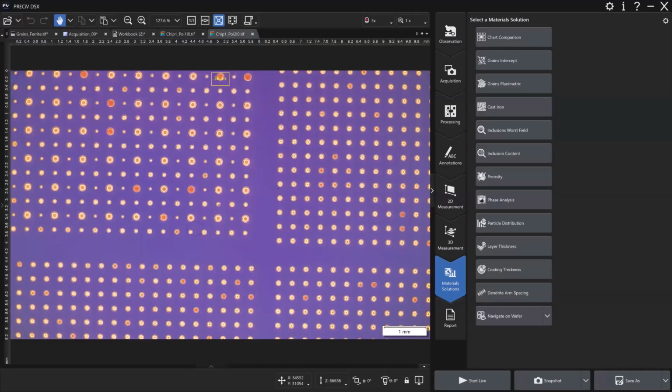So it has the original way we've calibrated software for years by putting a standard on the microscope. The standard has a known distance, and you go to the specific objective or zoom value, and a user marks the distance and then tells the software that distance is X, if it's 100 microns or 50 microns, whatever it is. And then the software would calibrate the pixels per micron.